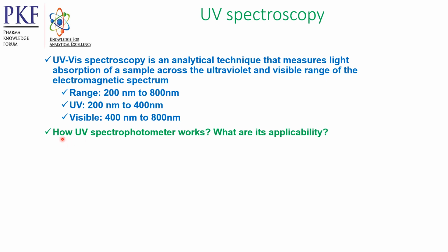Now the question is how a UV spectrophotometer works, what are its different components, what are its applicability. I am going to discuss in the next slide.